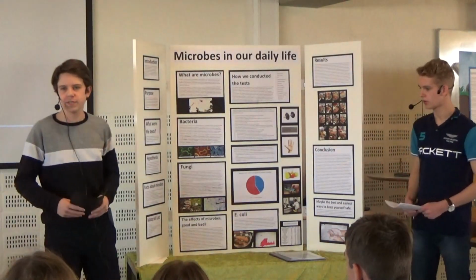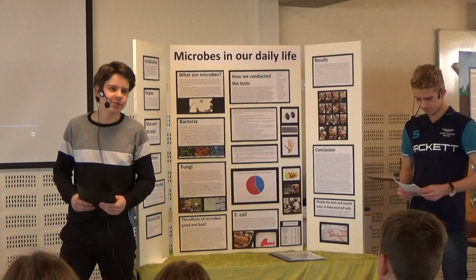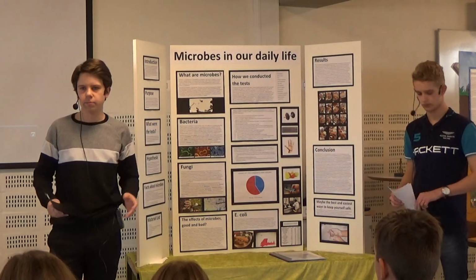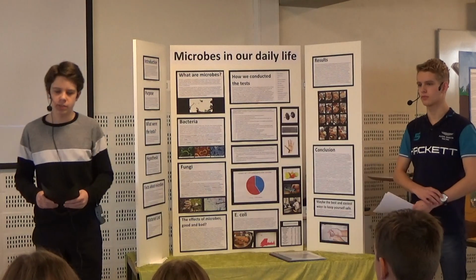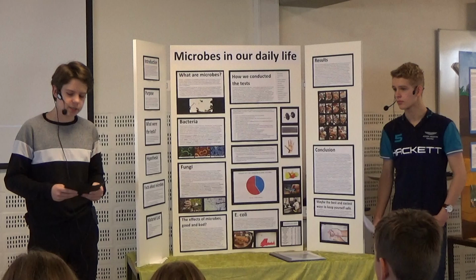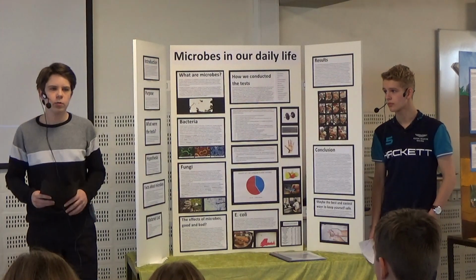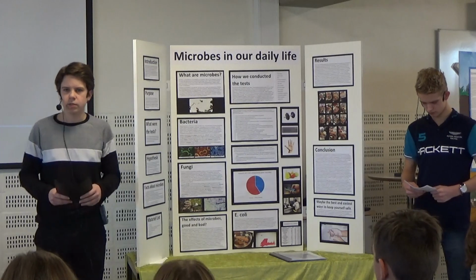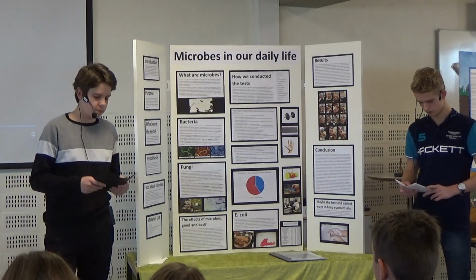Now we have shown you how we did the experiment, and we hope you are excited to hear our results. When we had made the sample size and were looking under the microscope, we first found a lot of fungi. Then we started thinking about what that yellow, creamy and shiny bacteria was that had contaminated nearly all the agar plates. Then we made a slide where we only tested one colony of that exact type.